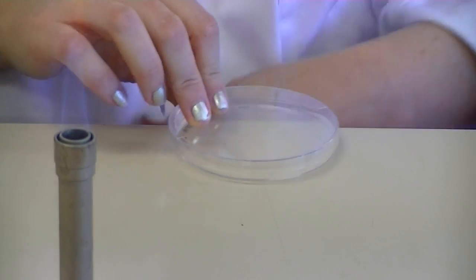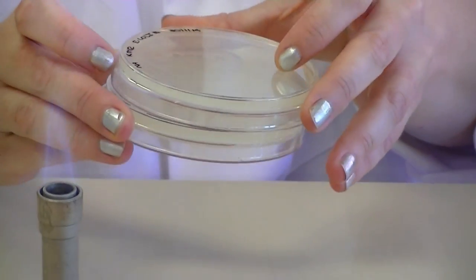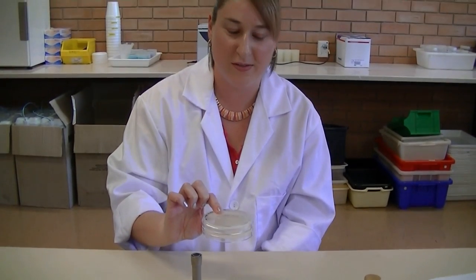Again, this plate is going to be incubated so we can pair it with the other plate. It must be upside down so that the condensation from the lid doesn't drop onto the surface of the plate.